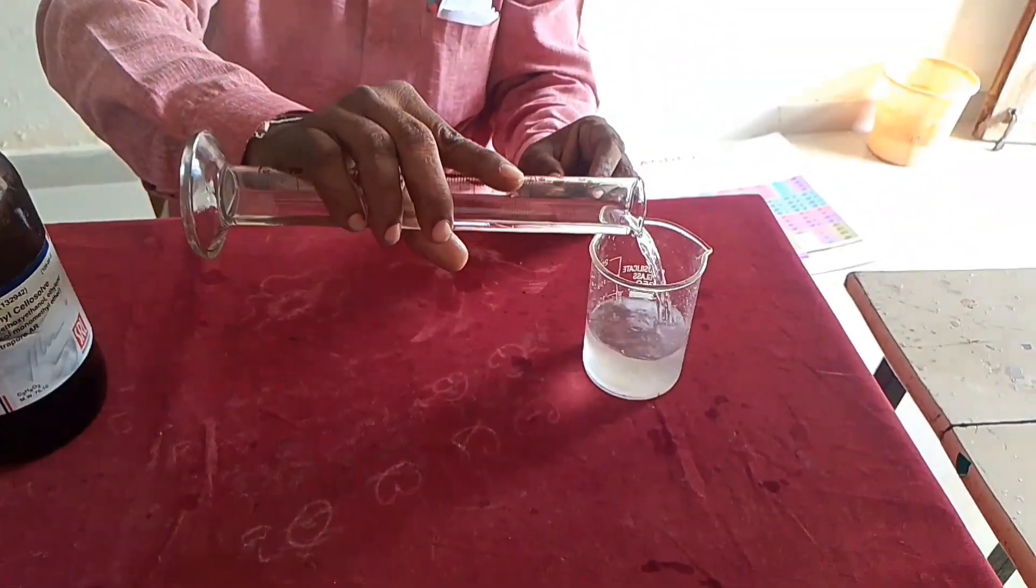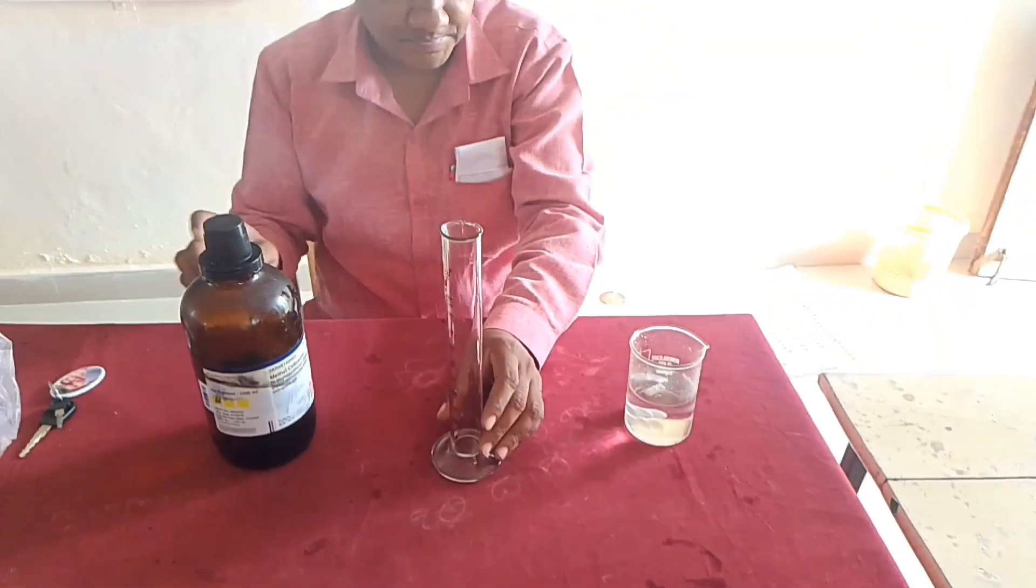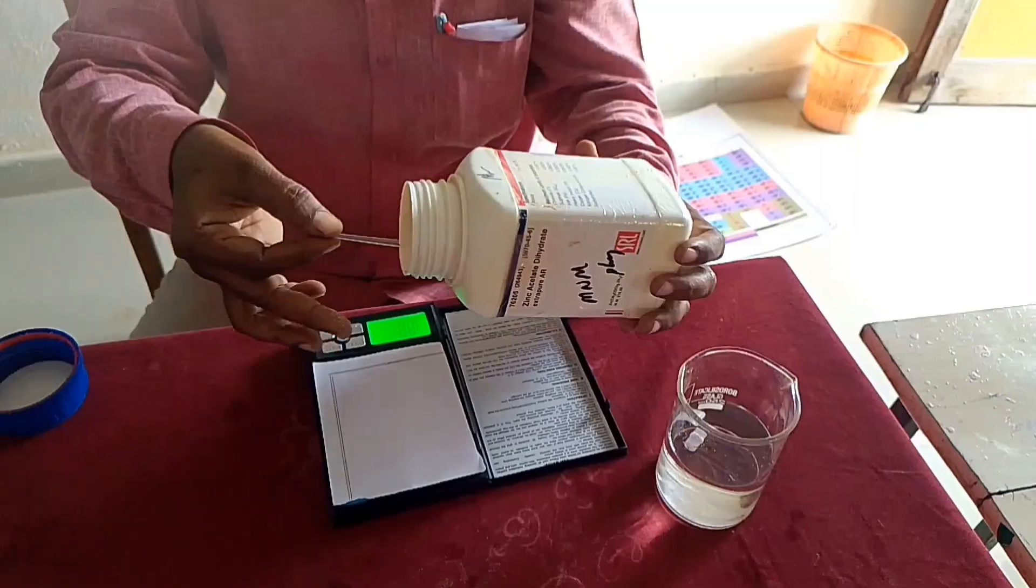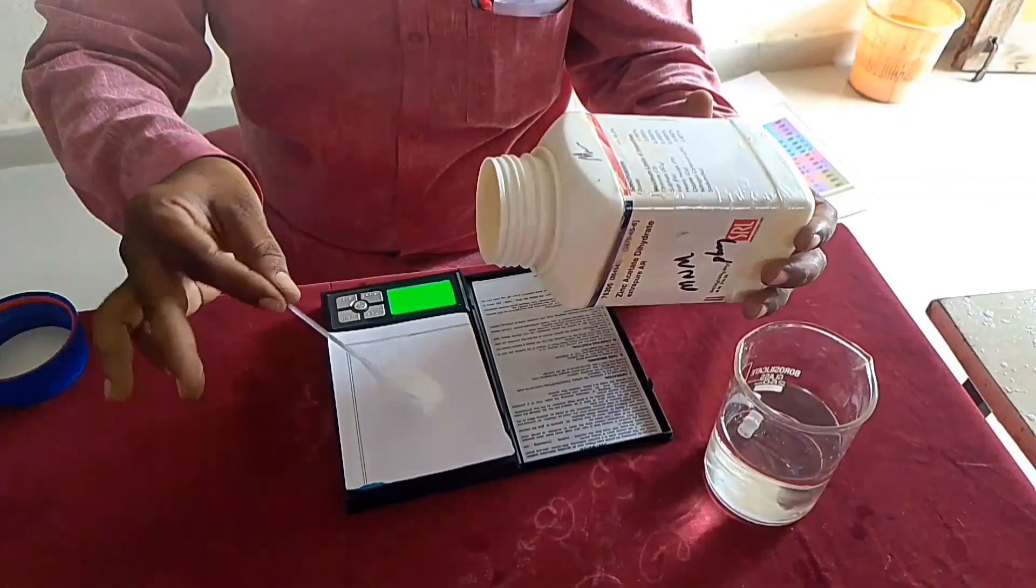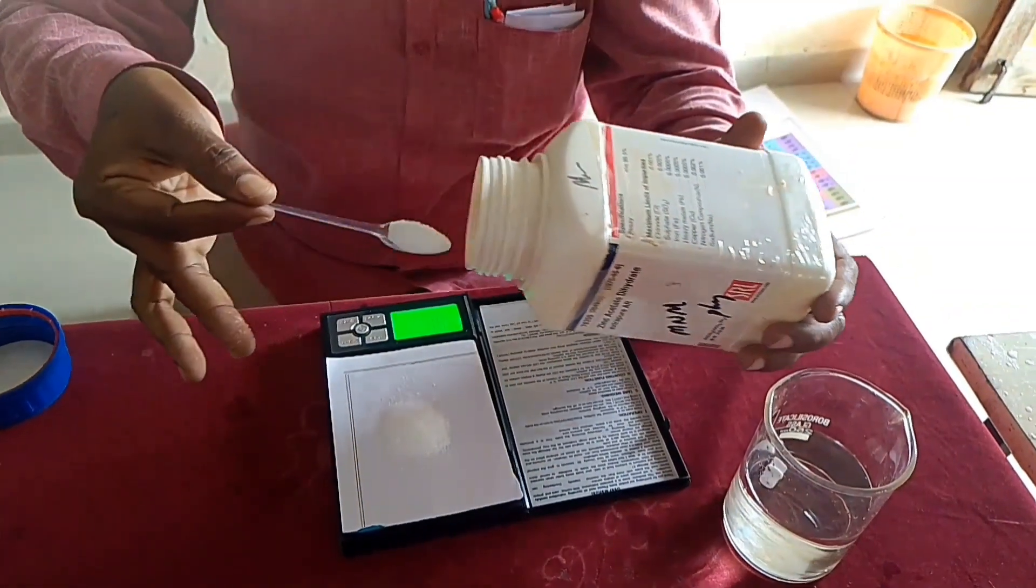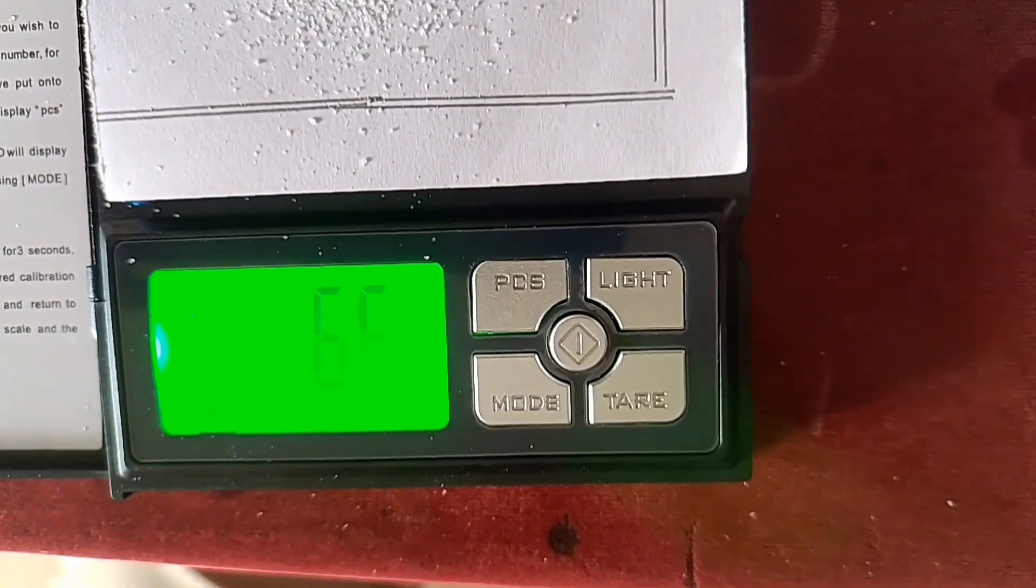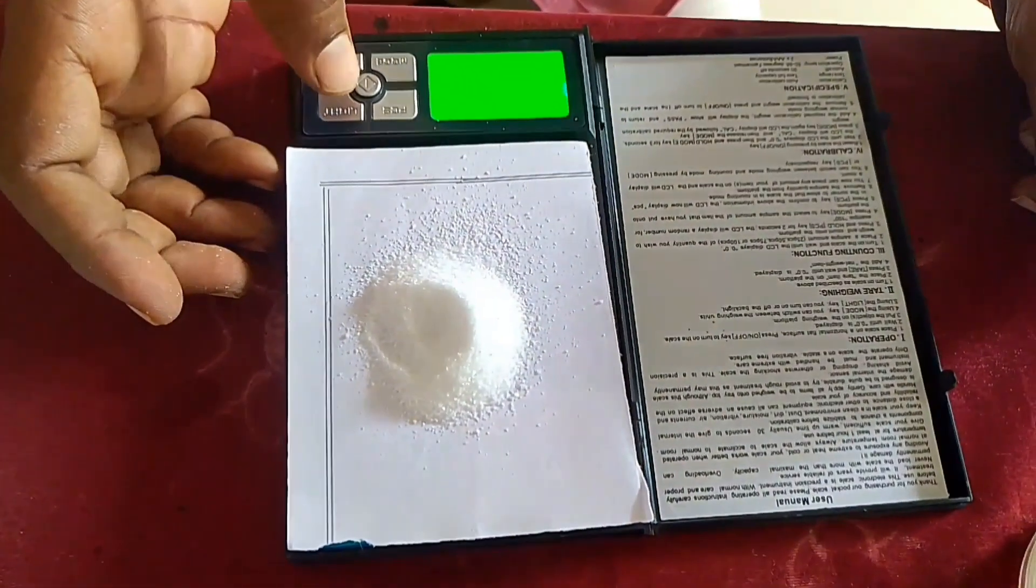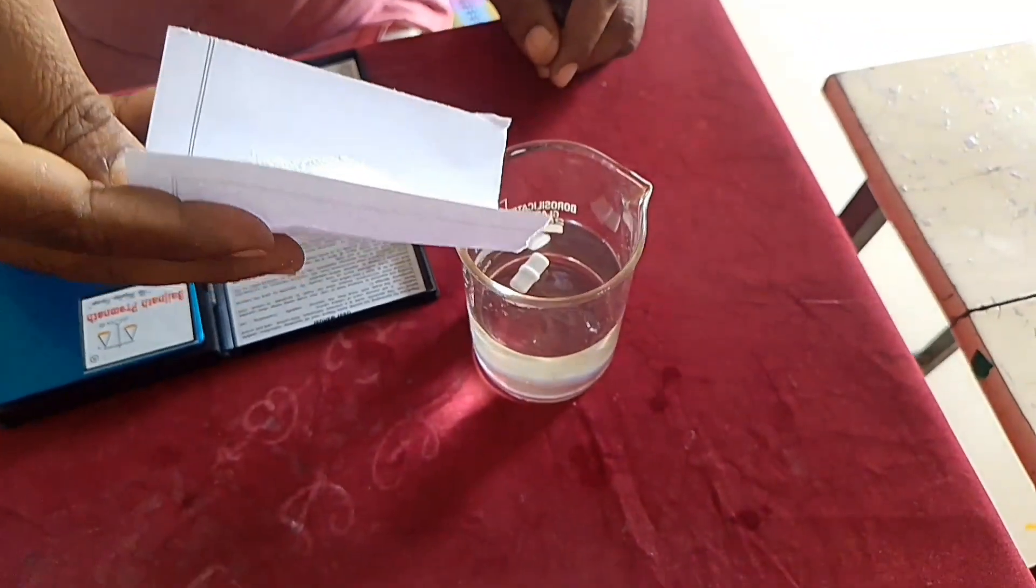This is the source of zinc oxide nanomaterial: zinc acetate dihydrate which is the product from SRL Chemicals. I am going to take nearly 6.6 grams of this zinc acetate dihydrate. Add this amount of zinc acetate dihydrate powder to the solvent blending.